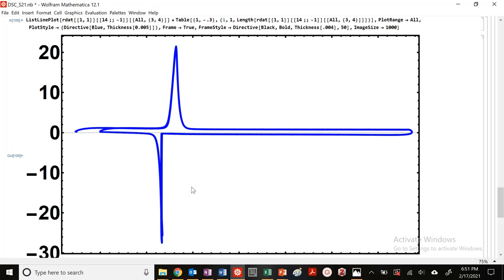I want to use this in an application where, for example, I need to embed this material into walls and keep it at room temperature. So I want this material to melt and solidify at the same temperature over and over again, for tens of thousands or even millions of cycles. Because if there are shifts between each cycle, then who knows? In 5 years, my room might be at 100 degrees C or minus 100 degrees C. So we don't want that.